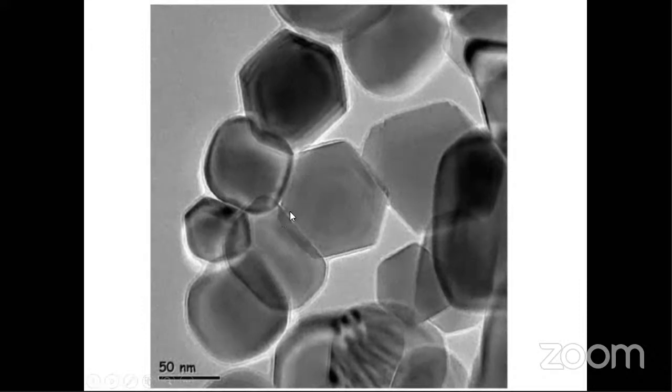So this is the beauty of TEM, that we can study the entire internal structure of the crystal, and you can also find that these hexagonal crystals are formed. Those are basically the hexagonal unit cells of zinc oxide.